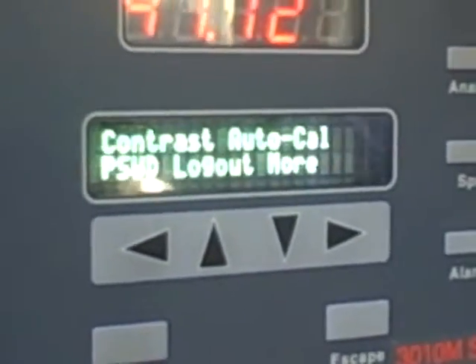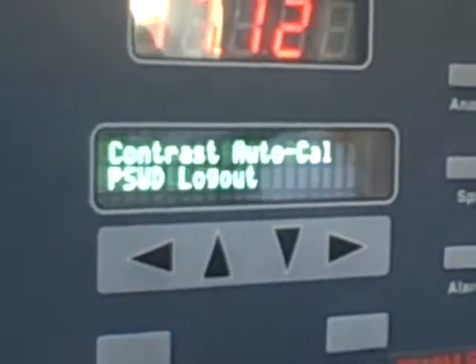The important part, if you go back to the screen that shows the count, oops, wrong button. Okay. This number right here, we want it to go up by about 10%. It was reading 105 at first.